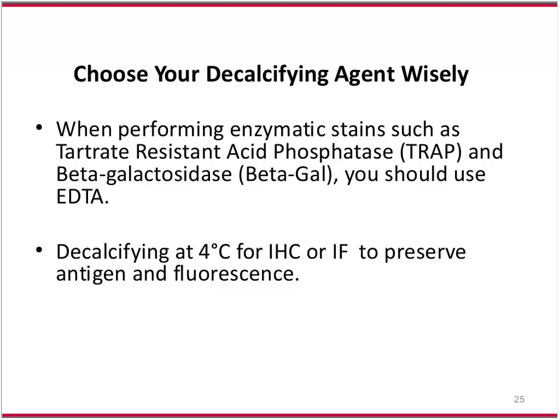Decalcifying at 4 degrees for IHC or immunofluorescence to preserve antigens and fluorescence, that's very important. And if you're even doing laser capture microdissection, you're going to want to make sure that your decalcifying agent was either purchased from a sterile environment or made in a sterile environment with deionized water, autoclaved, all sorts of things. It all goes back to knowing exactly what you want to see at the end.